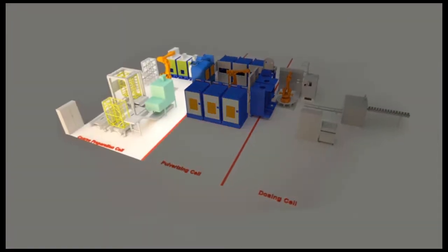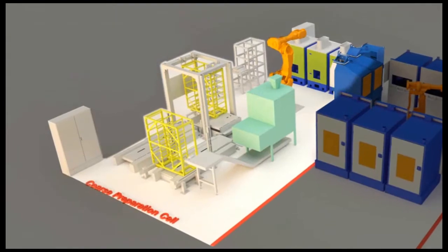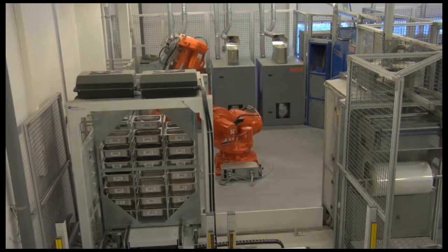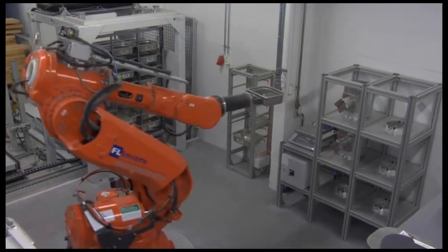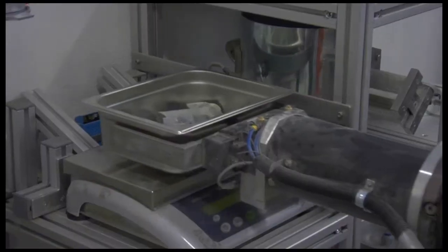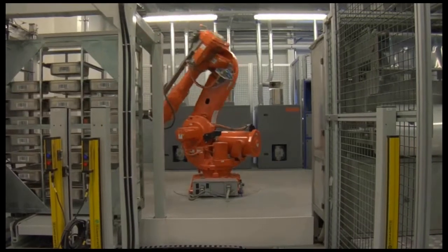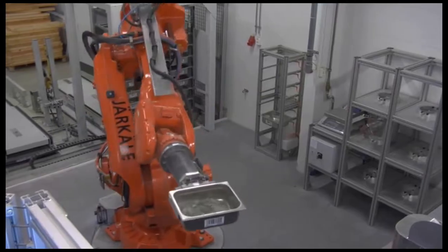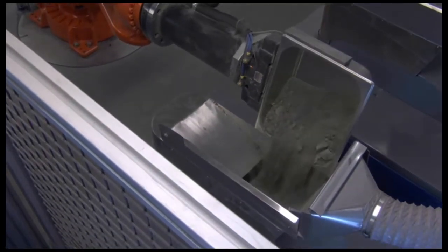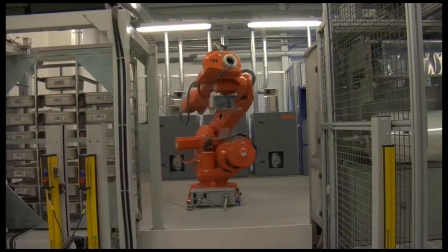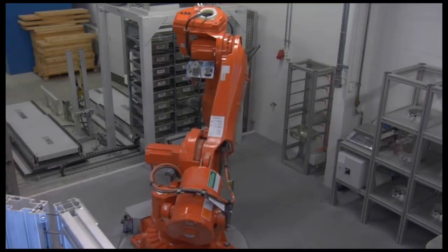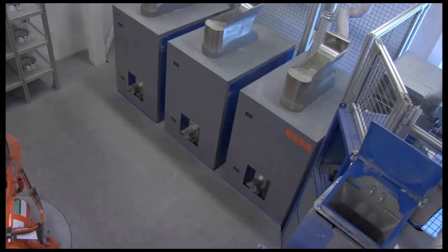The first cell is the coarse preparation cell. Here, the samples are again weighed, and original moisture content is registered. Then the sample is crushed in one of the three large jaw crushers. The crusher output weight is used by the QCX software to determine possible sample blockings.